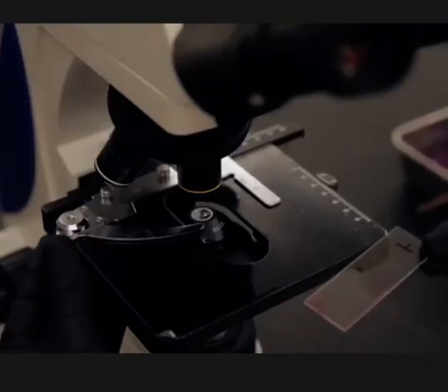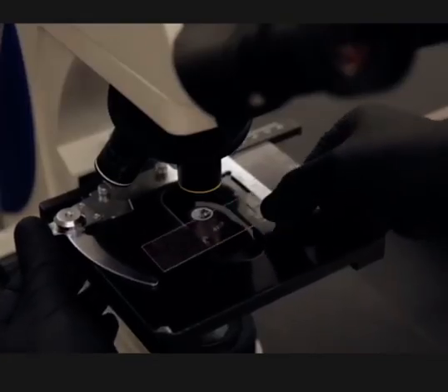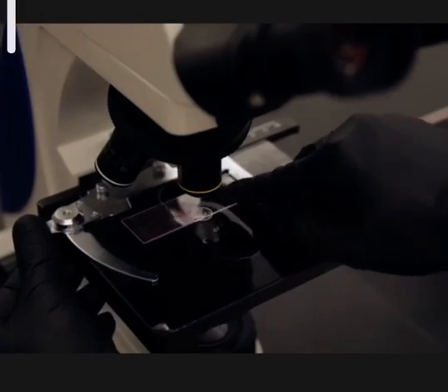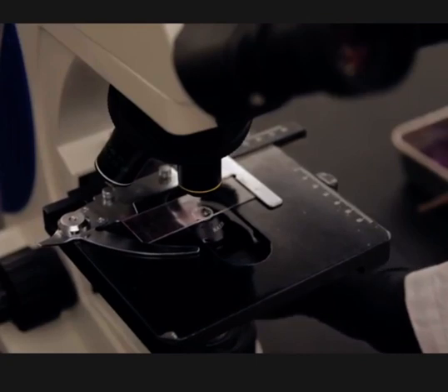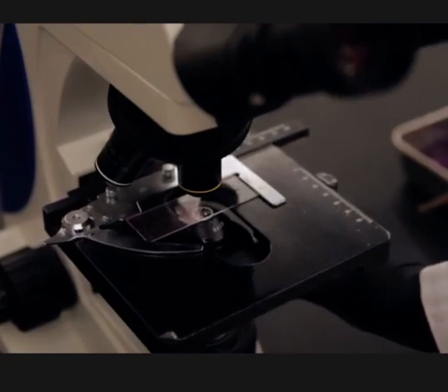This video will demonstrate the direct visualization of the biotic and abiotic components of rhizosphere soil in order to understand factors affecting soil changes and to predict environmental stresses.